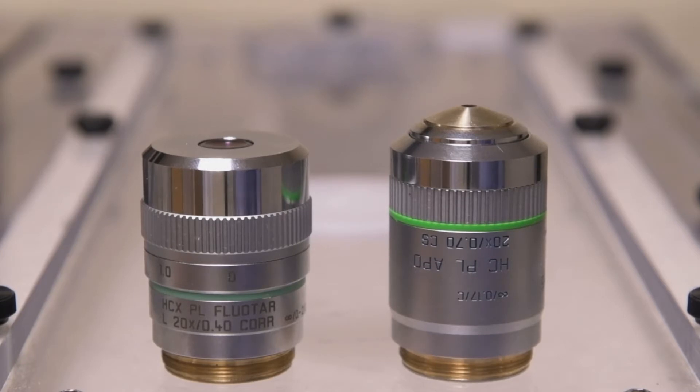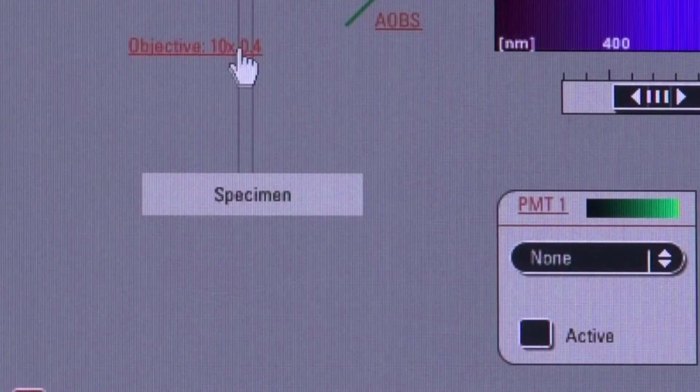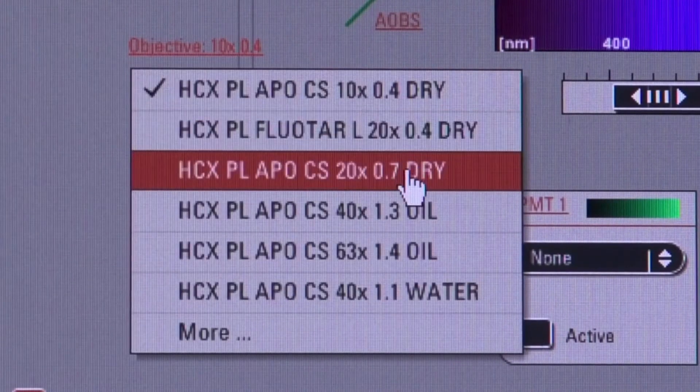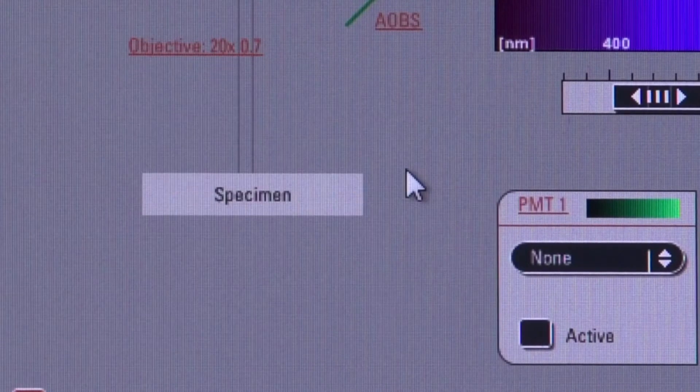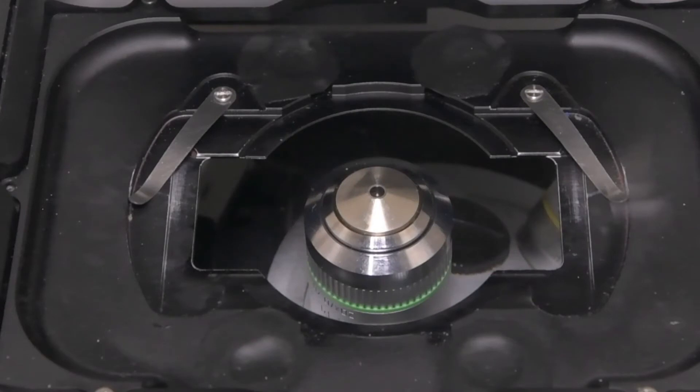This 20X has an NA of 0.4 and the other is 0.7, so we want to use the 0.7 if we can. If you have a slide or a coverslip bottom dish, the higher NA objective will work nicely. Let's click on the 20X 0.7 objective and the lens will automatically flip into place over in the microscope. The 20X 0.7 NA looks like this. It's a bit larger than the 10X and extends further up. You can also see the green band along the bottom.